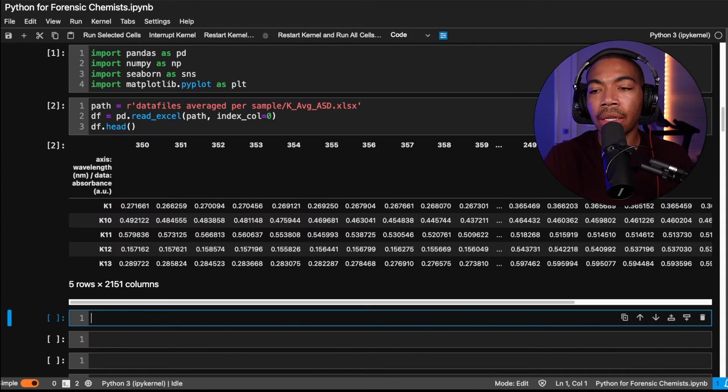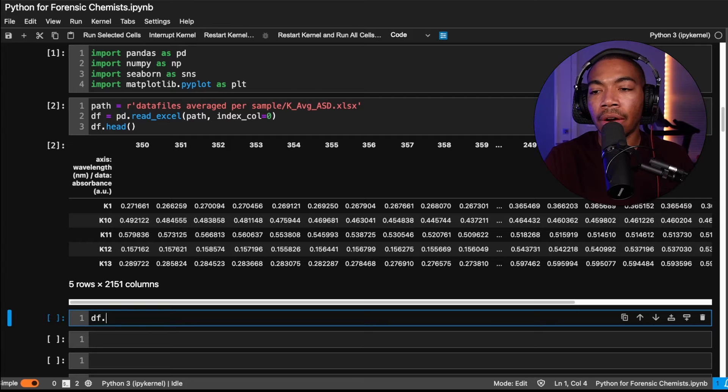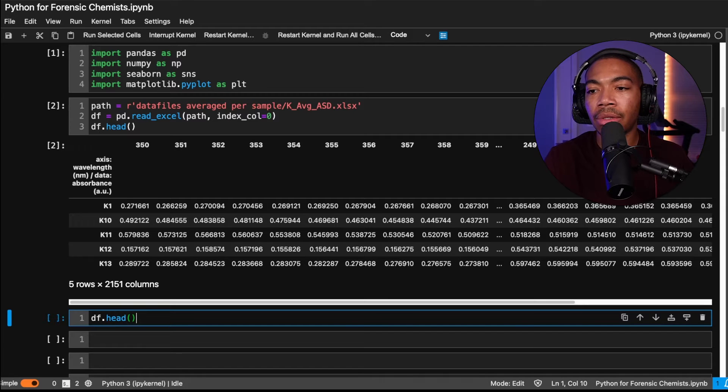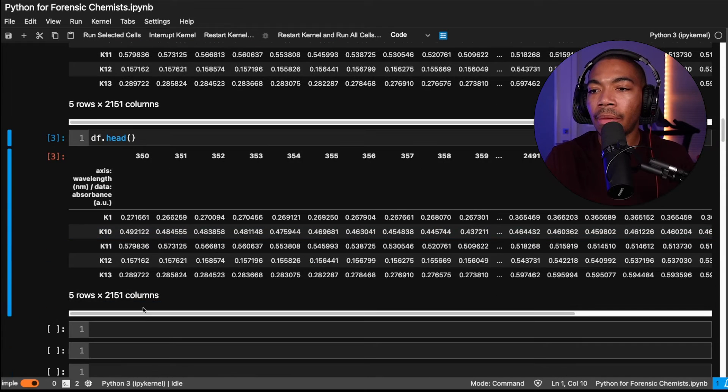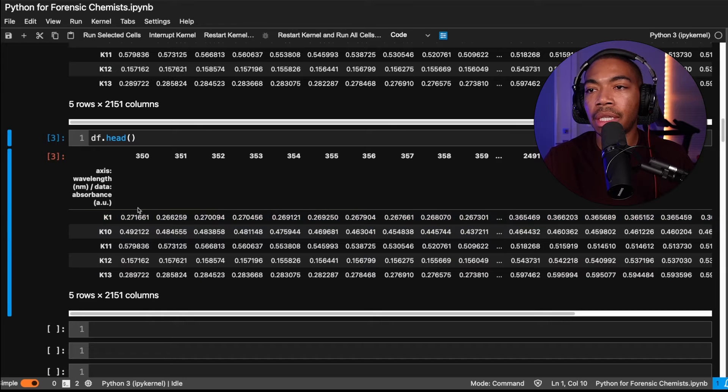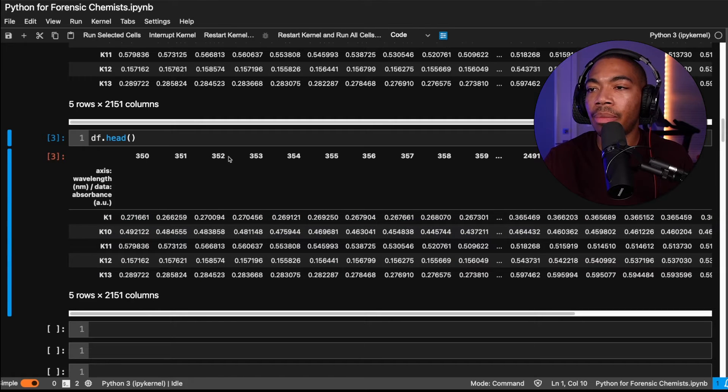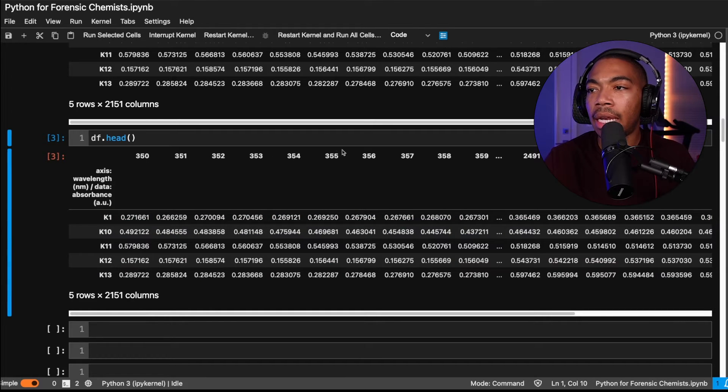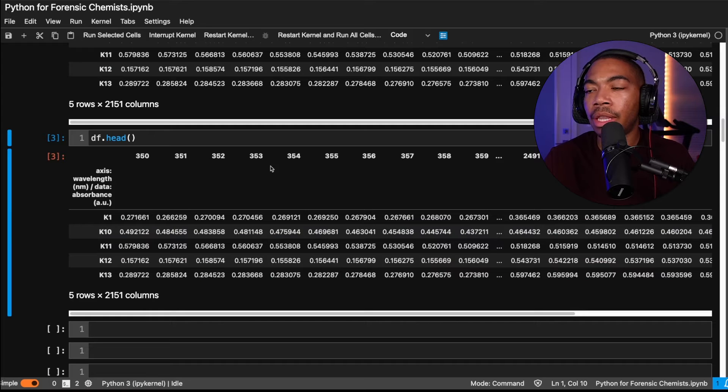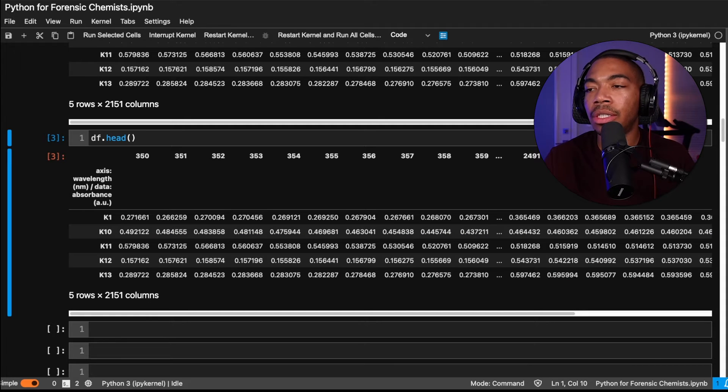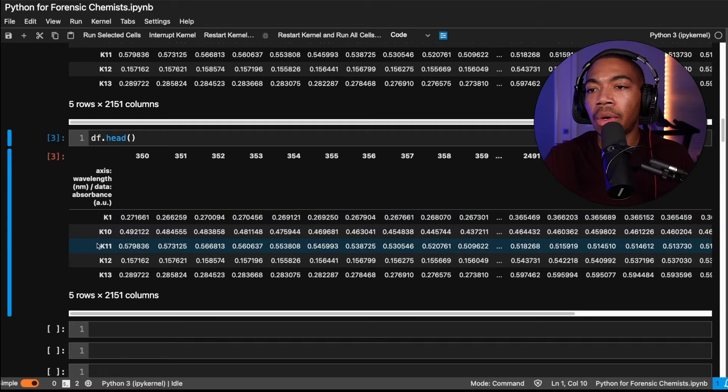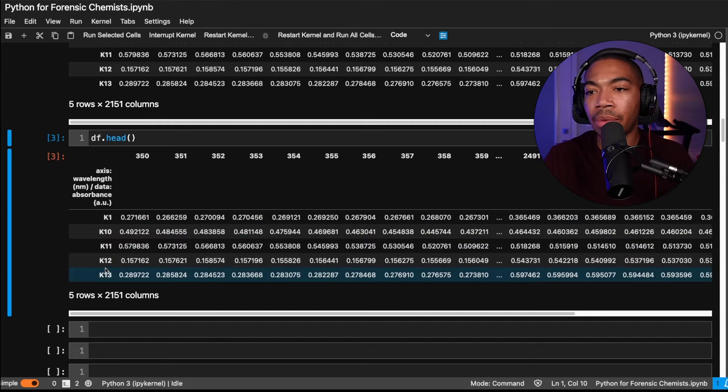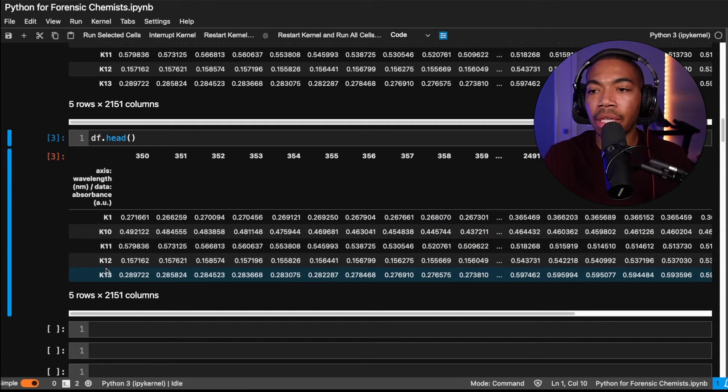So first, let me show you what this data looks like so we can get an idea of our starting point. So if we just use the df.head, this will give us the first five rows of this data frame where each column is a wavelength and, in this case, we're in the visible and IR regions of the electromagnetic spectrum, and each row is its own sample.